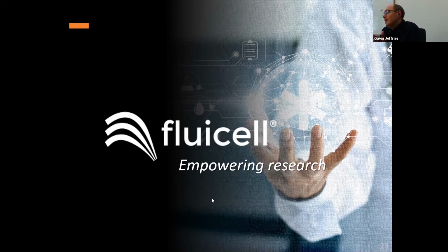The big advantage of doing it in that way is that you can generate fairly reproducible samples. So you can have many duplicates using exactly the same cell origin. So you don't have to have as many controls to state, okay, this can be part of this population, because you can actually say what the genetic origin of all of these tissues was and exactly how they were built and what all the shapes are.